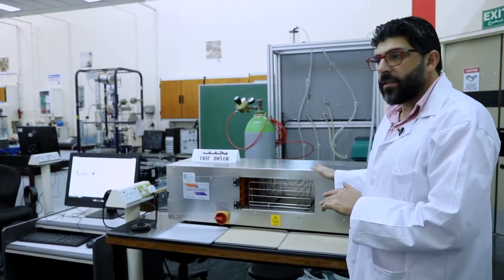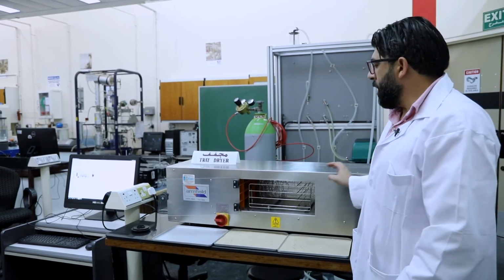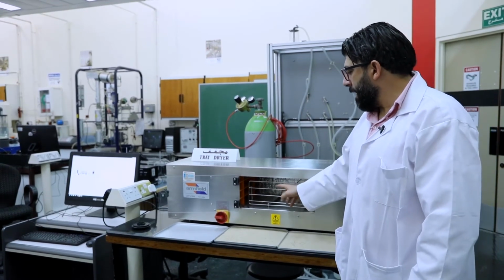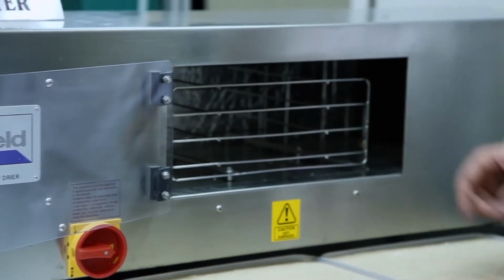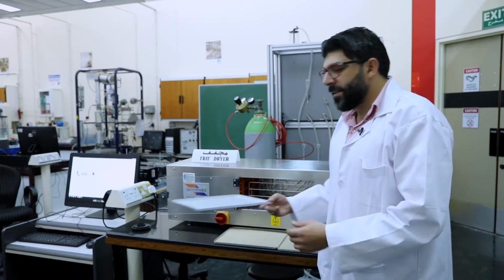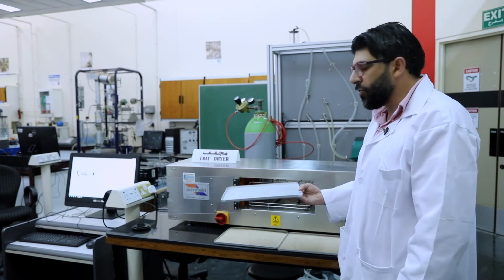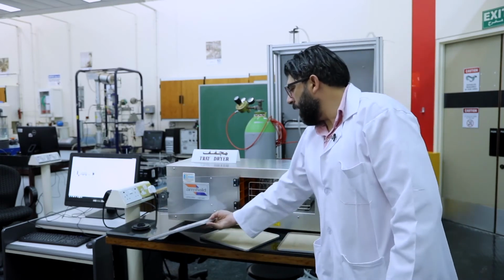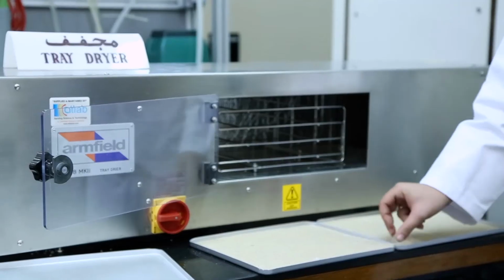We have the tray dryer. This is a lab tray dryer. So we have here something like a balance to weigh the trays. So we have 3 trays. This one is an empty tray. We will just use it to weigh the empty tray. And we have trays with sand.